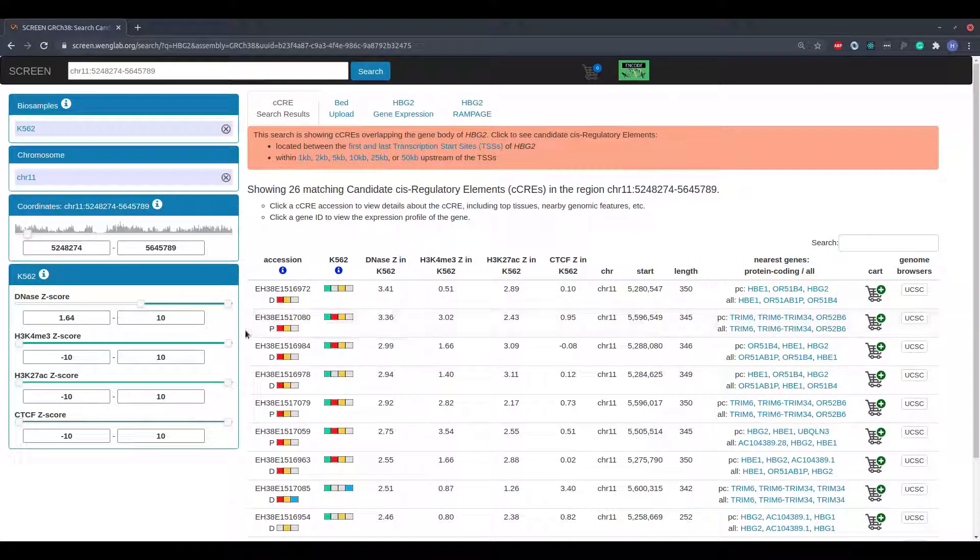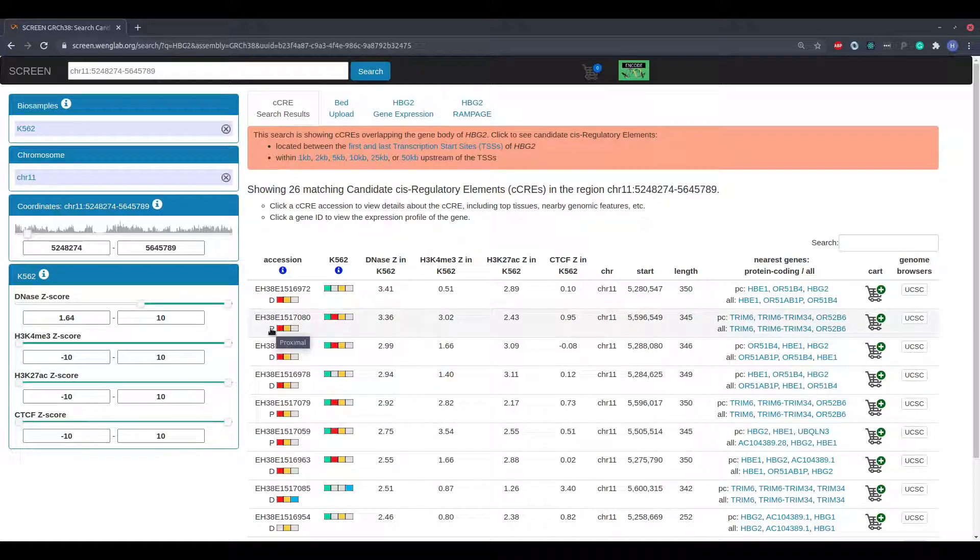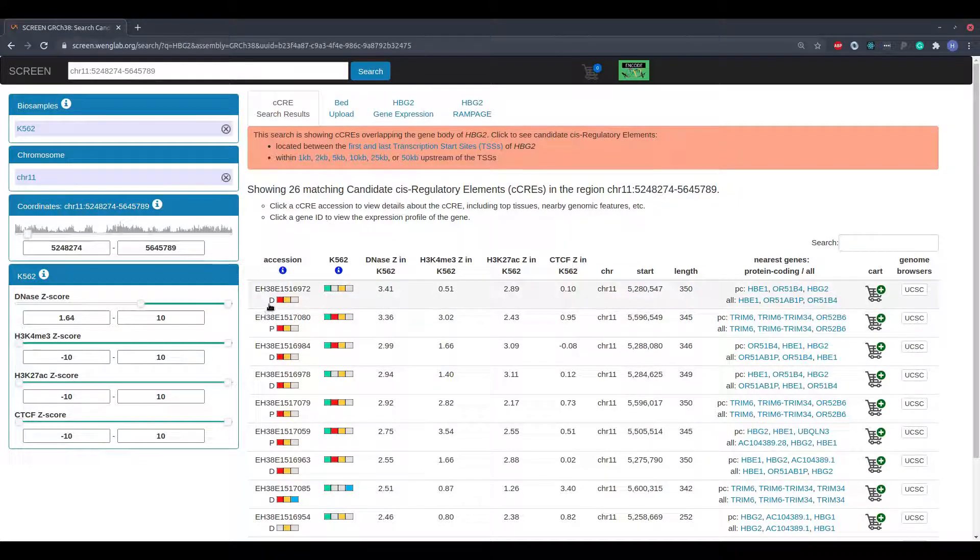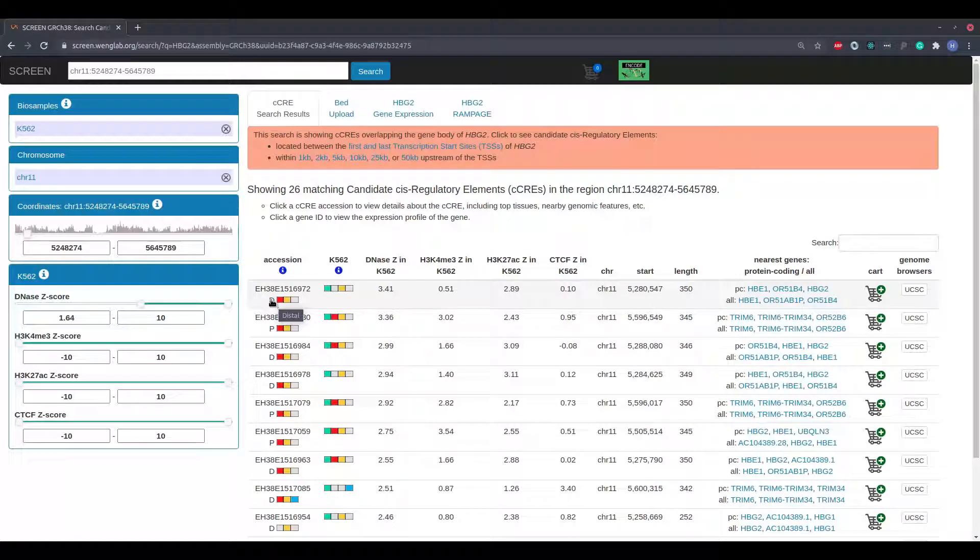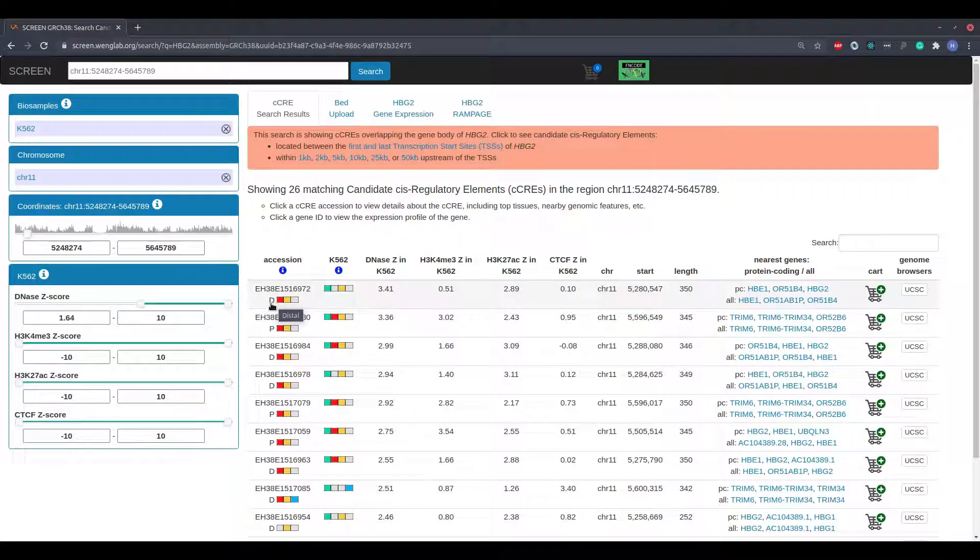Elements within two kilobases of a transcription start site are flagged with a P for proximal. Elements which are more than two kilobases from a transcription start site are flagged with a D for distal.